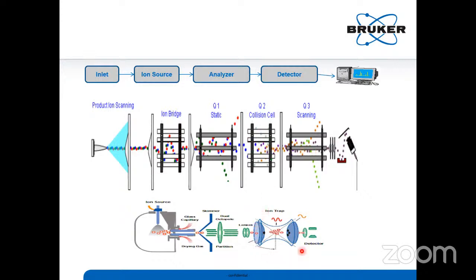But in ion trap technology, everything, MS scanning, MS fragmentation, analyzing, will happen in the same compartment as a 3D compartment. You can observe here the ion source, same as before, through LC your sample is moving here. Charged ions enter the glass capillary. From here, the octopole will filter and make an ion path only for charged ions.